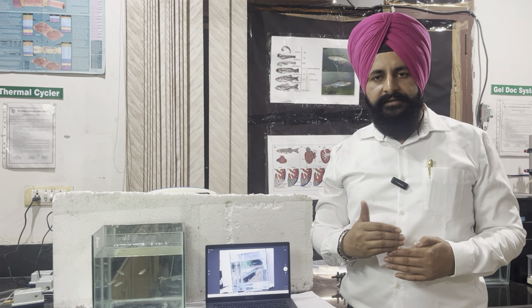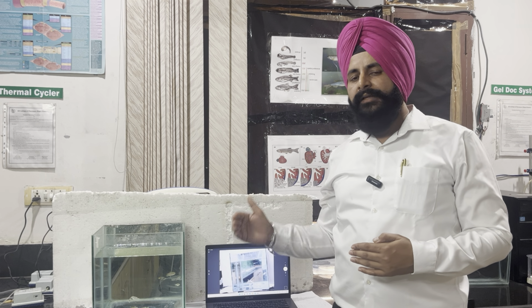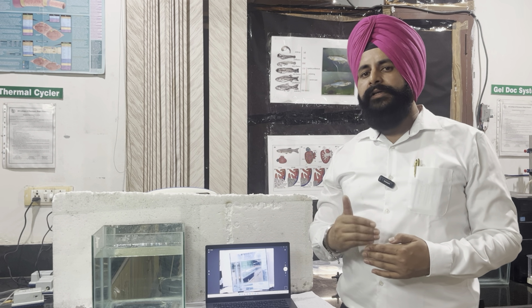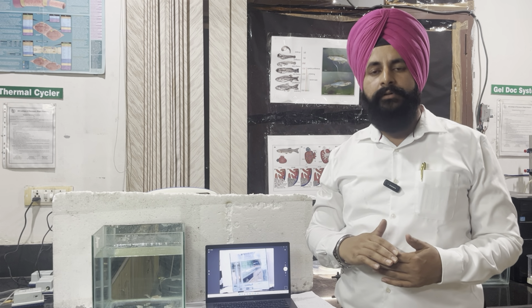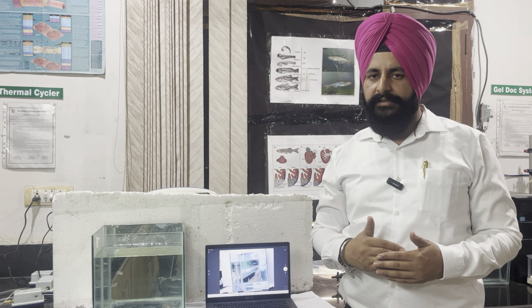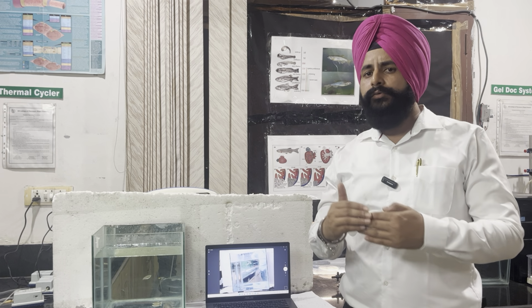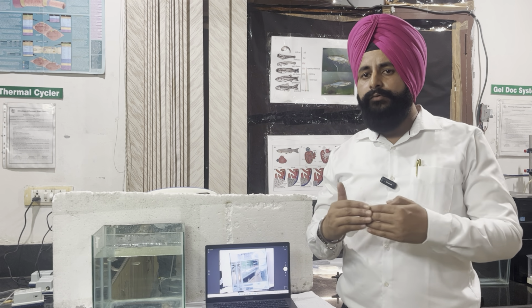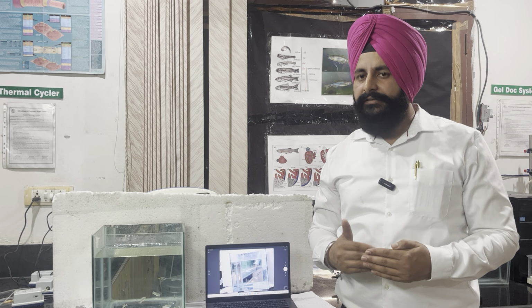So if you want to induce anxiety in a zebrafish, I will discuss with you the different models. Then I will discuss how we induce anxiety by using this mirror chamber apparatus. And what are the causes of anxiety? The first cause of anxiety is when you expose your zebrafish to a predator, that means if you are exposing your fish to unknown stimuli, that can cause anxiety.